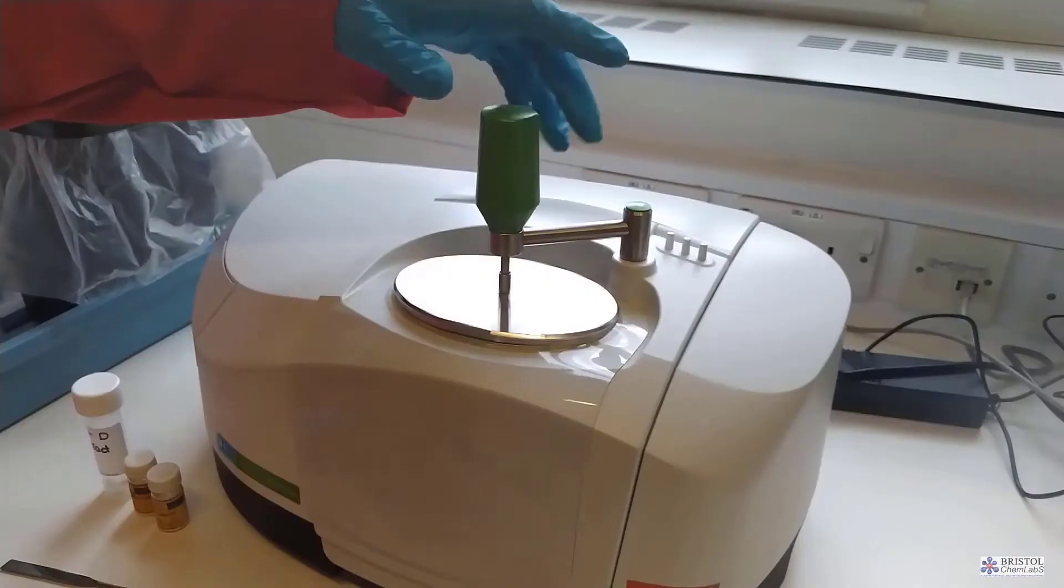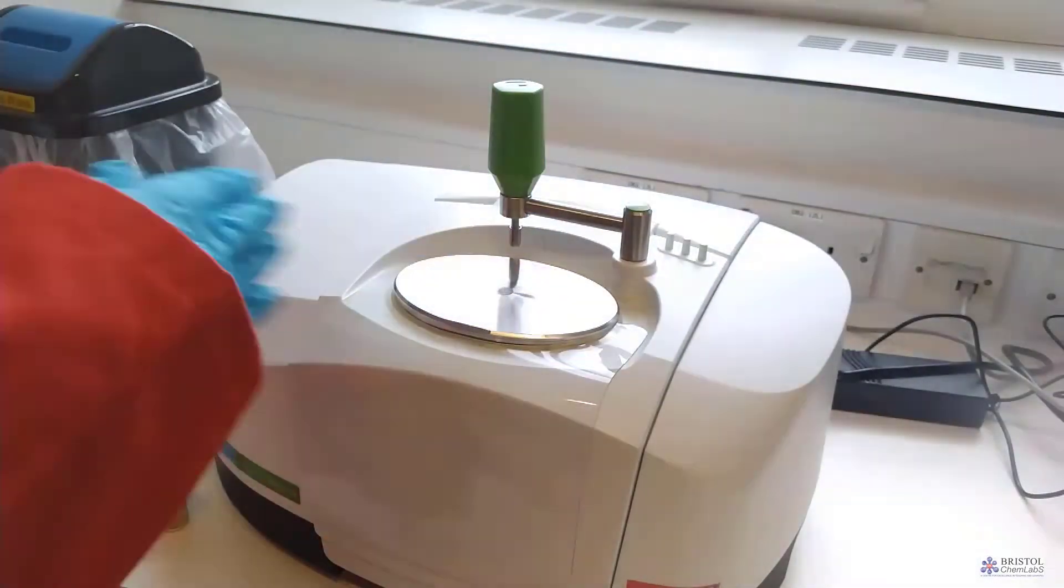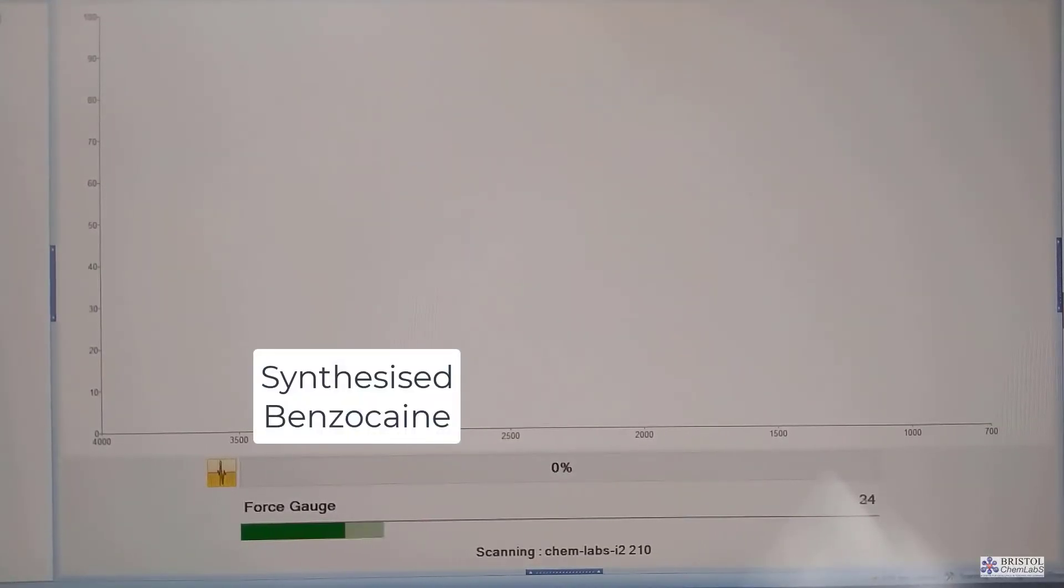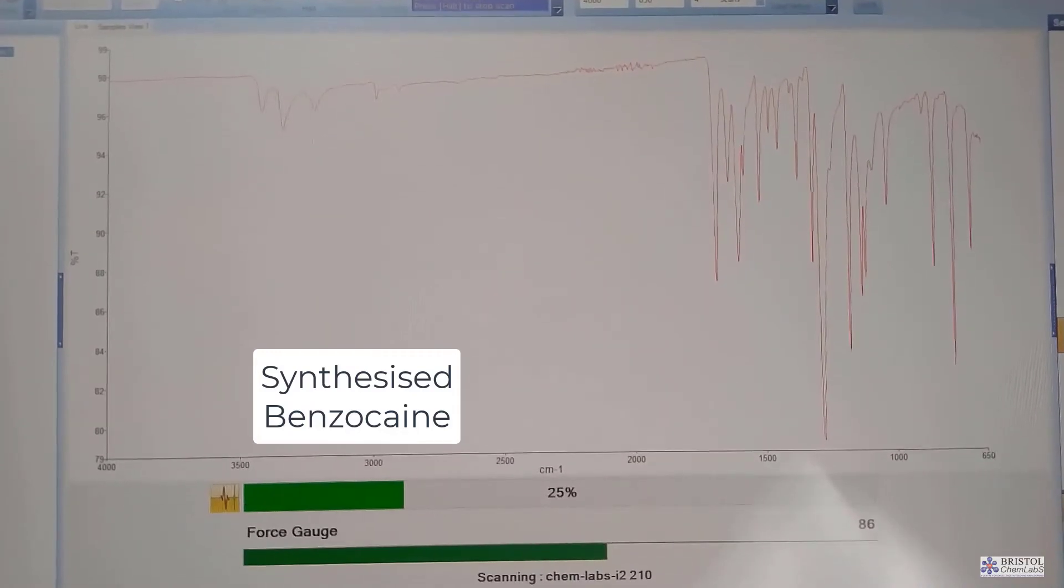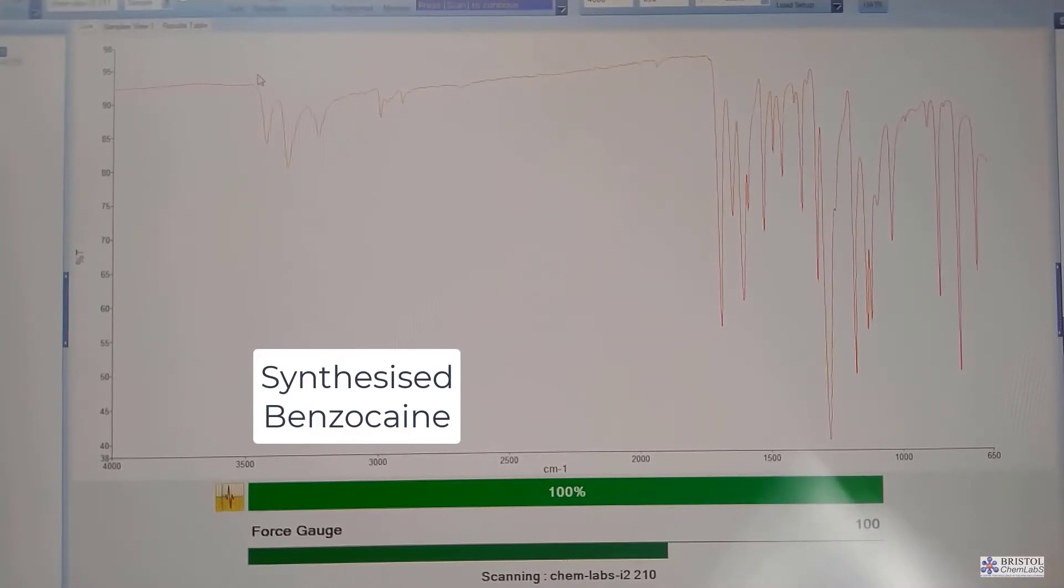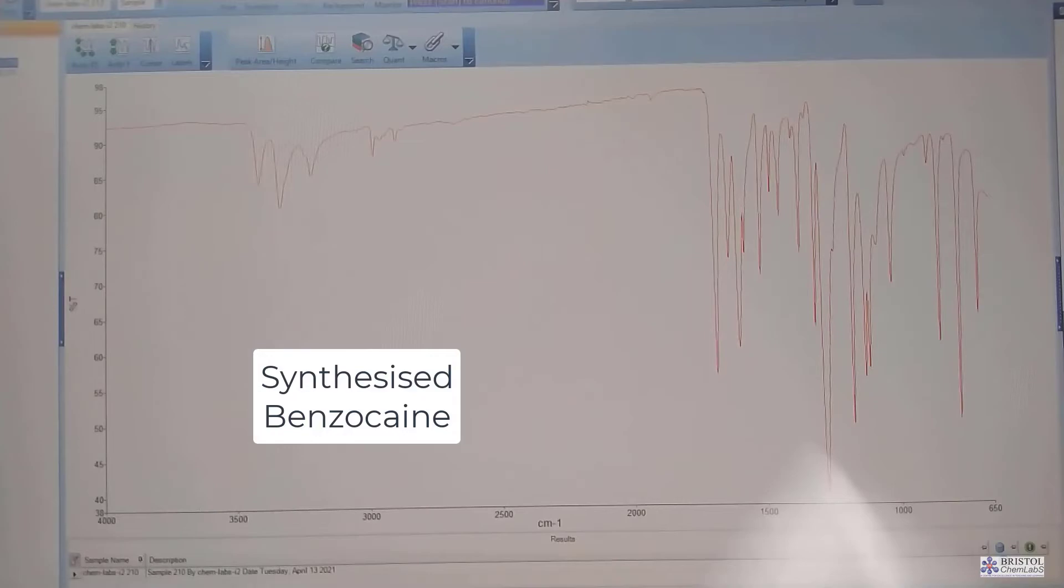Before we run a sample we do a background test. We simply let the infrared spectrometer know the air that we are using which happens to be the air in the laboratory. The software allows this spectrum of air to be removed from the sample. Of course between sample crystals there will be some air trapped. When this is done we put a small amount of our product under test onto the diamond, screw down the mirror and set the spectrometer off. The spectrometer here is usually set to run four scans, remove any anomalies and remove the spectrum of air.